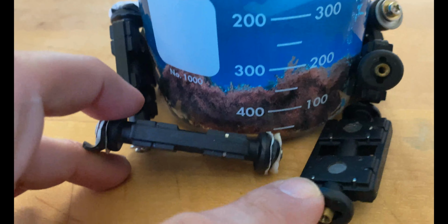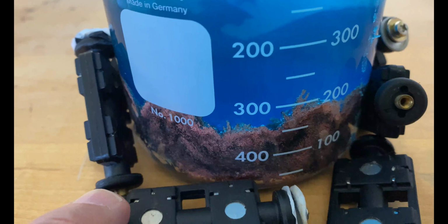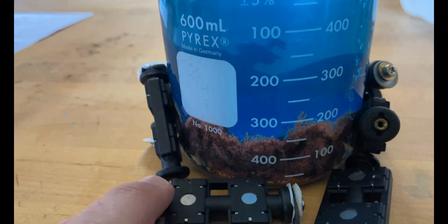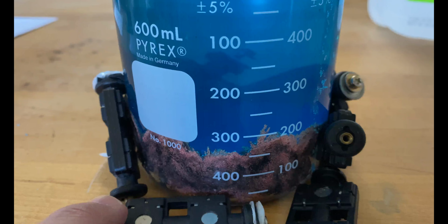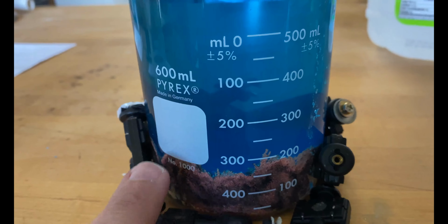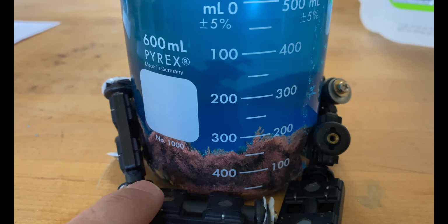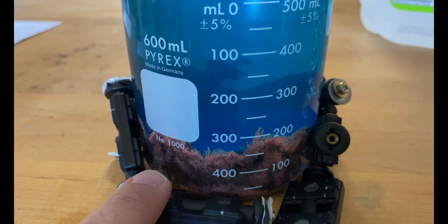So, I'm getting this sort of blackened discoloration in there. Gosh, I don't know whether to let it continue to react or to just take it apart and decant some of this out. I'm leaning towards decanting this a little bit because it hasn't even changed to a greenish tone. I mean, it's mostly blue vitriol. So maybe we can do a control with the same solution and some iron filings without the magnets and see what we get.